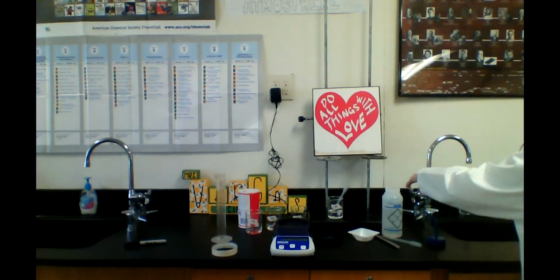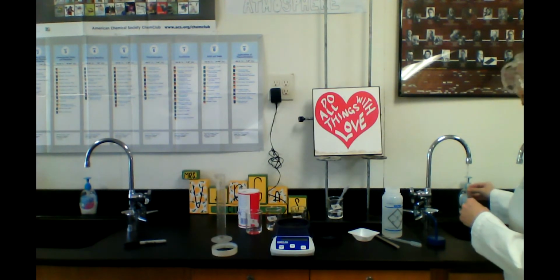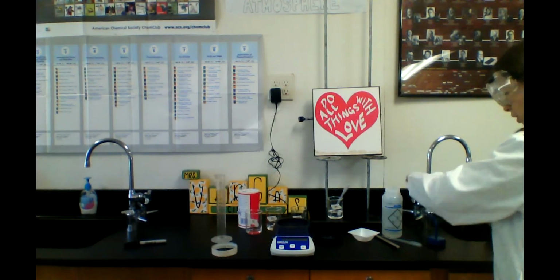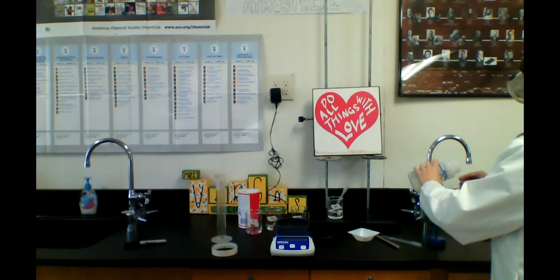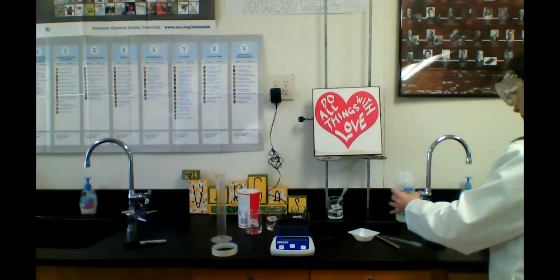So what we're going to do now is I'm going to rinse this again. And when you're measuring things in the lab, often we can reuse our equipment, but we have to make sure we rinse in between. And if we have a gradient in concentration like we do, then we're going to make sure we go from low concentration to high. Okay, so let me just dry my hands off really quick.